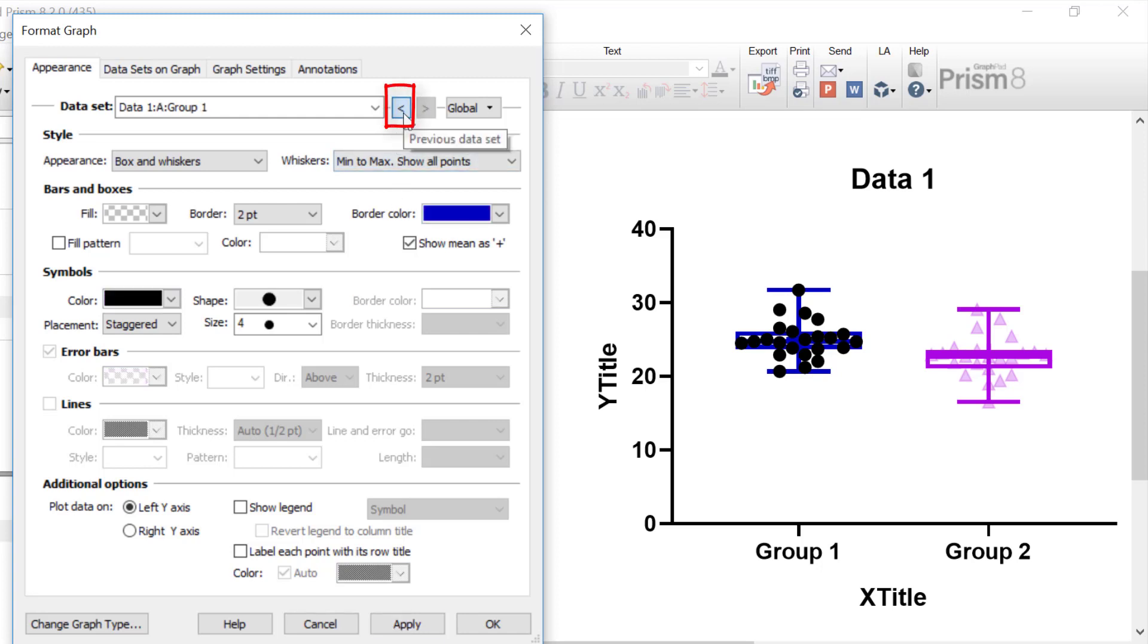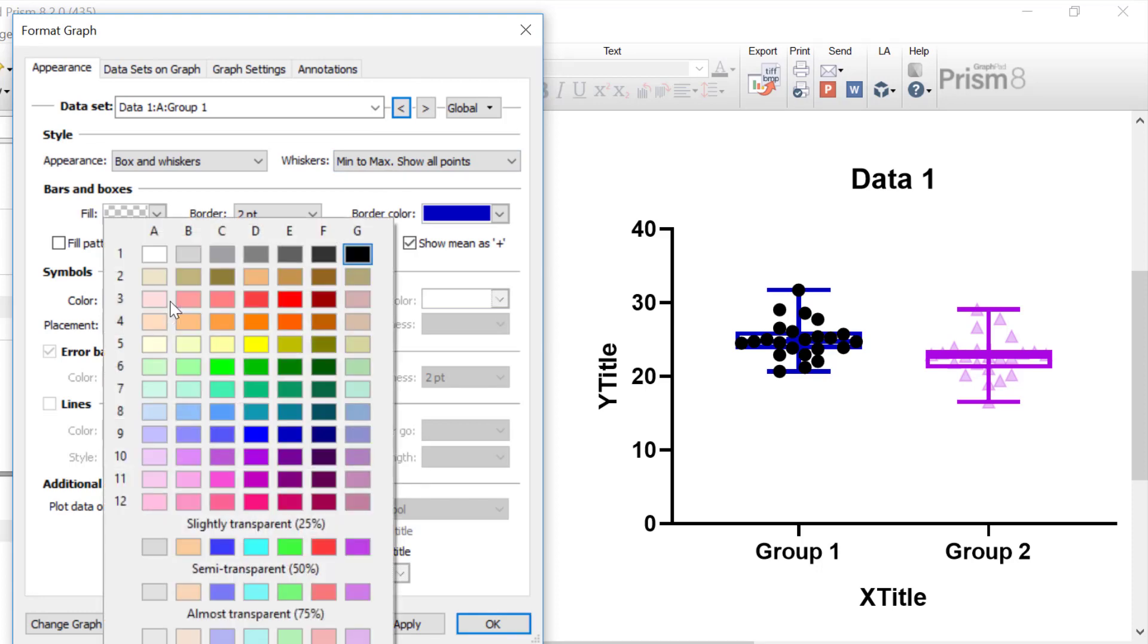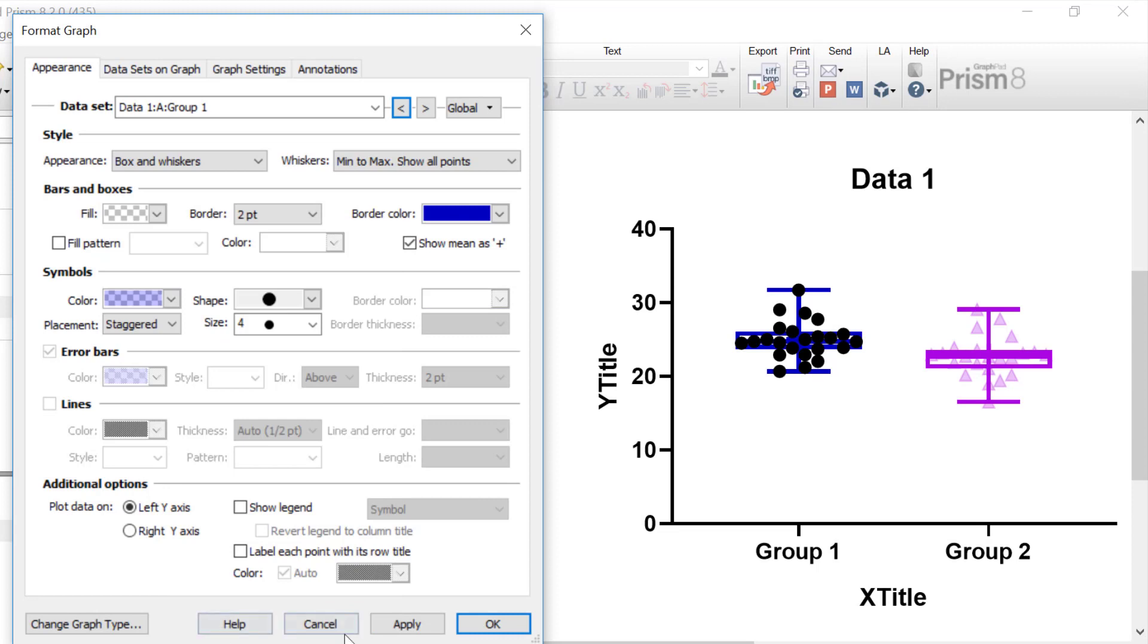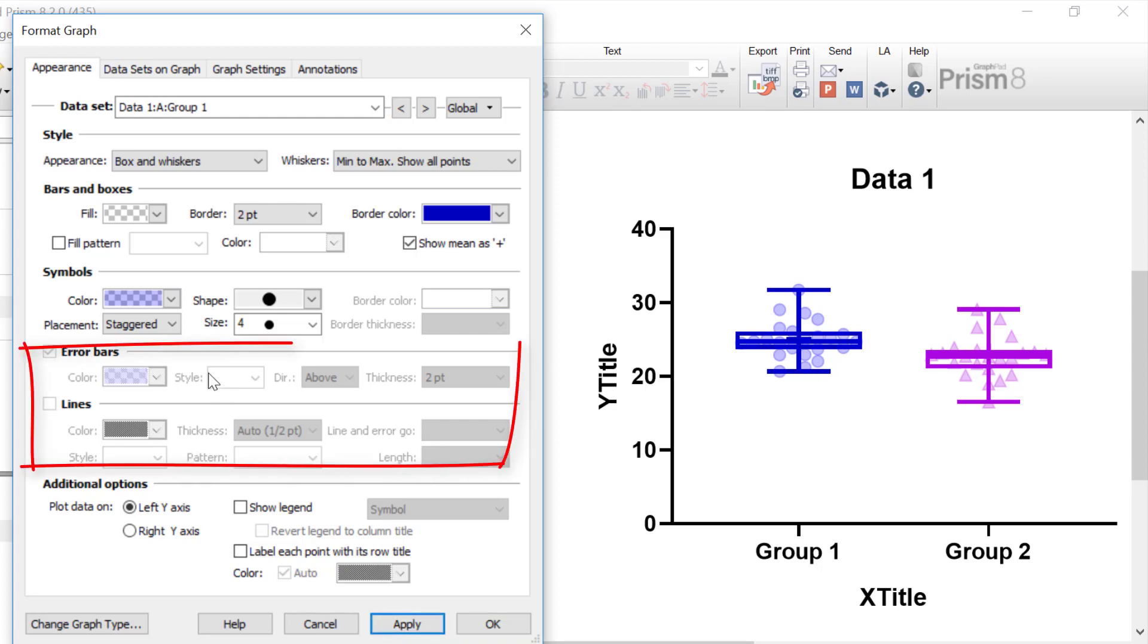So I'm going to toggle back to my first group here and I'm going to do a similar thing where I'm going to change the color of the symbols to be a transparent blue in this case and then click the apply button. And again, this looks a lot better now so we can actually see the box and whisker plot itself. The options for error bars and lines will not be available to customize in box and whisker plots.